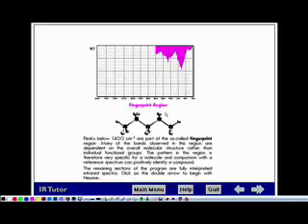But that's how they use it for fibers. You'll hear, oh, well, this person was wearing a nylon shirt made by whoever. Well, that's because they're comparing the infrared of the fibers. So that's where it's used a lot more. All right, so that's infrared. Where we're going to use infrared is to figure out whether a functional group is present or not. That's it. That's how we're going to use it this semester.